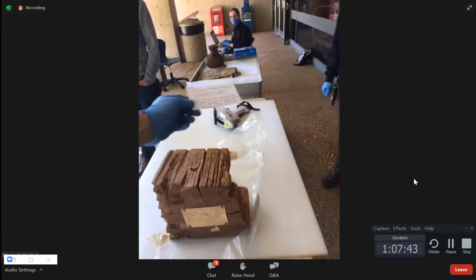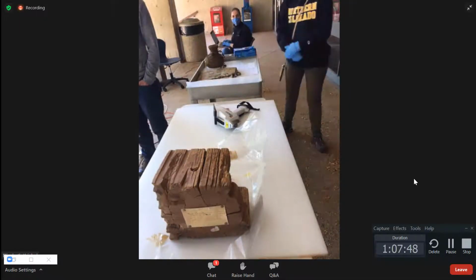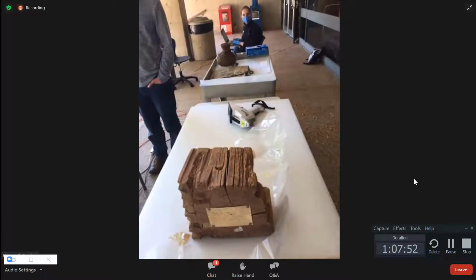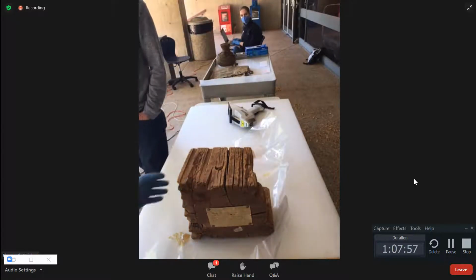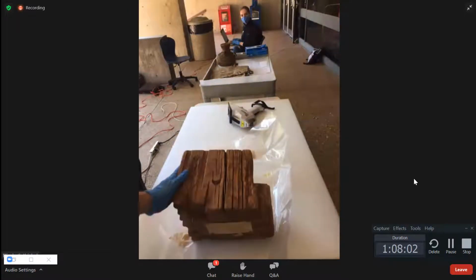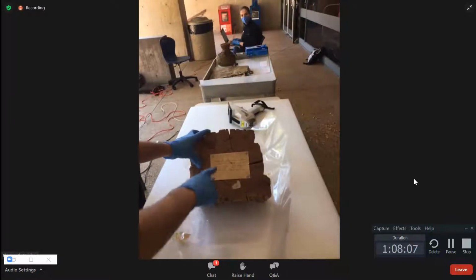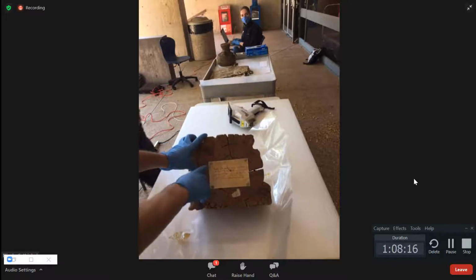I had a student do some research on this a couple of years ago. She thinks it might be from the beam of the mission church at Pecos, which was famously in ruins, and then the parts were dismantled and made into all kinds of other things. It shows signs of having some kind of pigment on it. It's been sawed. The things of interest here again are, do we have any toxic treatments? We're probably going to get that pigment. We might also be curious about this tag. I don't know if the tag would show toxins and this would not, but that might be a piece worth checking. We have these pins as well.